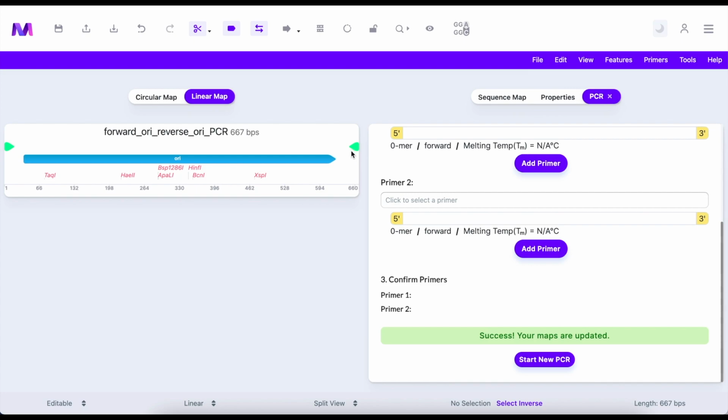Okay, great. So that concludes our tutorial on PCR simulation on Mendelgen.